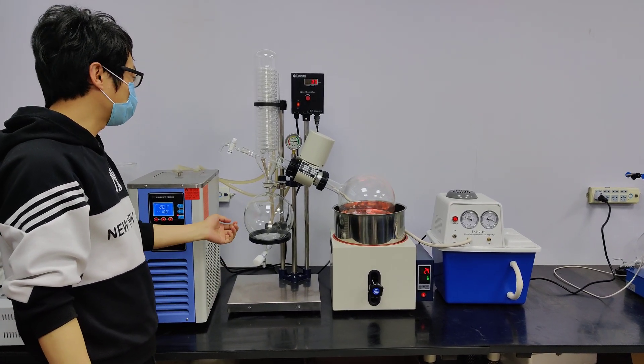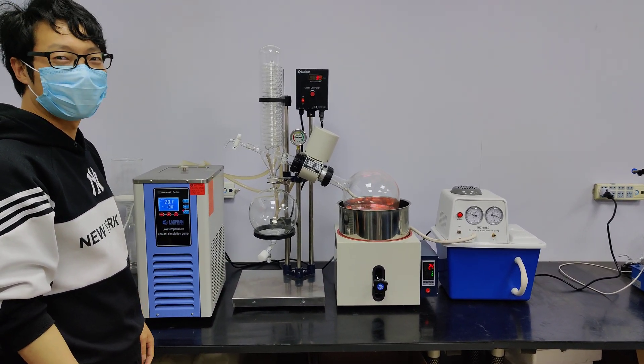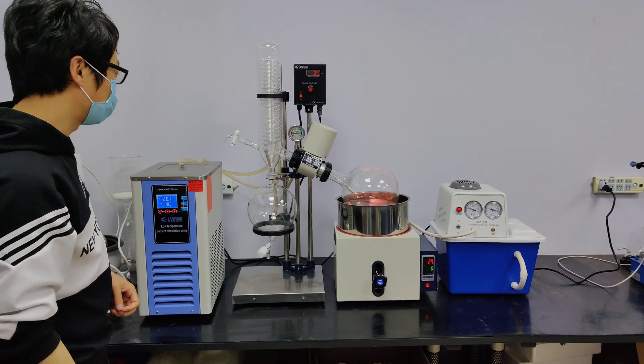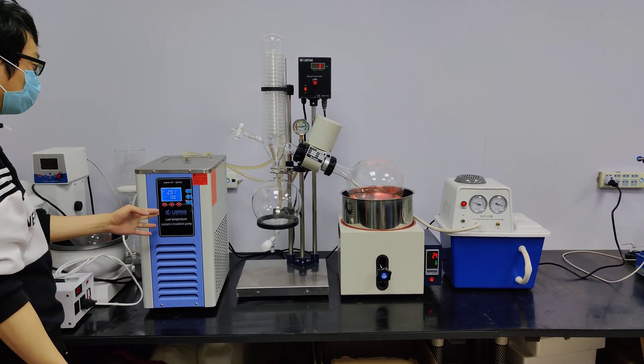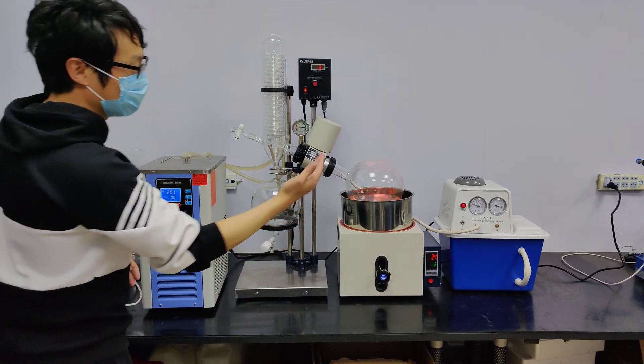Hello, everyone. Let's have a look at our 5-liter rotary evaporator setup. The 5-liter rotary evaporator works with a chiller and vacuum pump.